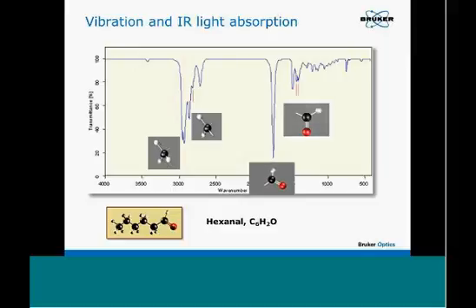Each individual chemical compound shows an individual spectrum. So if you have a library of spectra of known compounds, and you measure an unknown compound and run a search against the library, you can get knowledge about what compound it is. This is a very fundamental application of infrared spectroscopy. So when you know the spectrum, you can figure out the chemical structure.